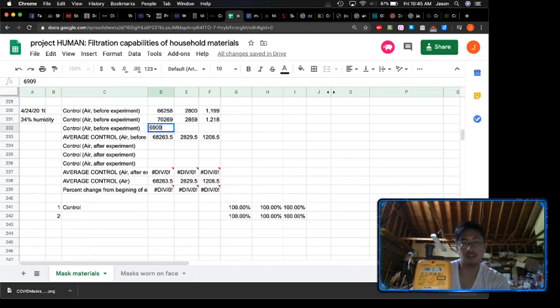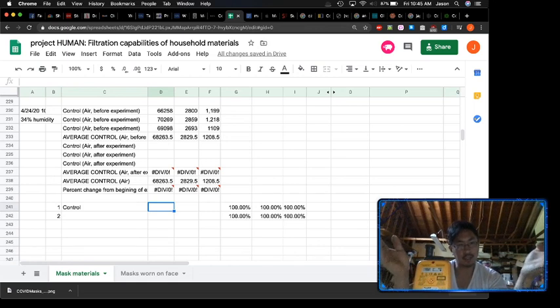All right, so 69,000. Okay, so I think what I'm gonna do is just do controls before every run. That way, I'm not gonna rely on the control before my experiment control. I'm just gonna do controls and then straight to a run, and then back to another control, back to another run. Yeah. That way I can keep my music. Music before science. Sorry, guys.